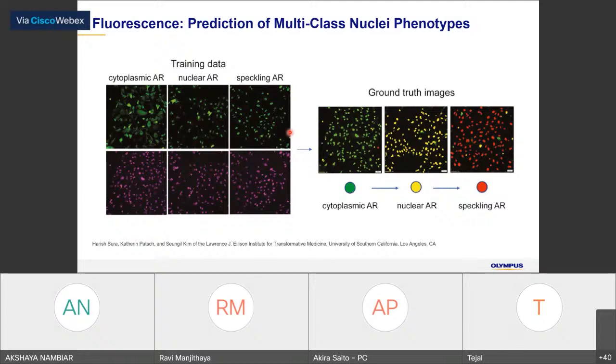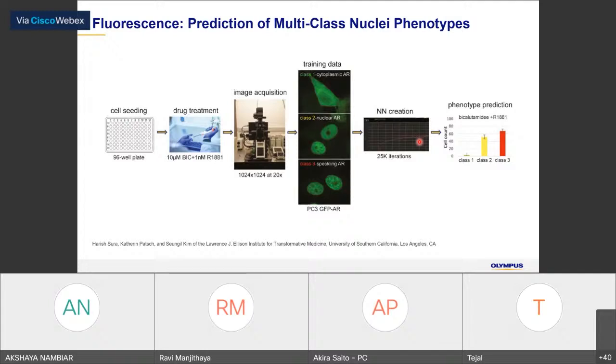Sorry that it's quite difficult to see, but the ground truth is labeled onto this image and given for training, so in the neural network it will differentiate that this very flat nucleus or some kind of spots we can see in the nucleus can be identified.